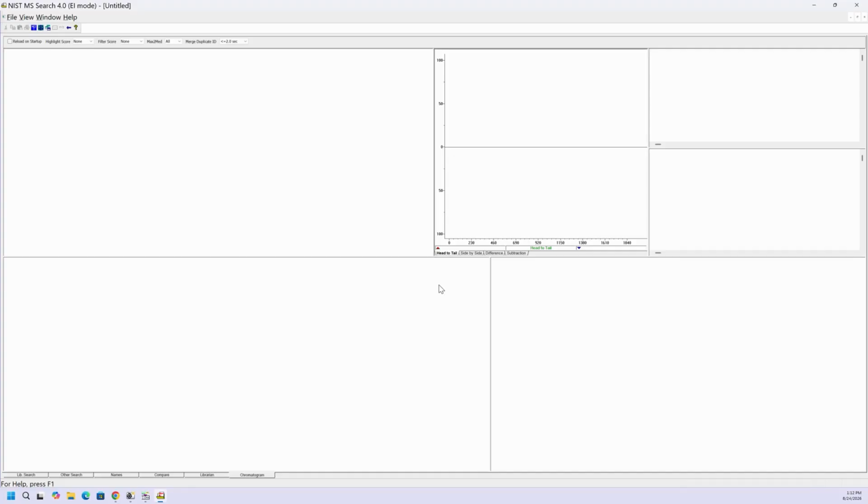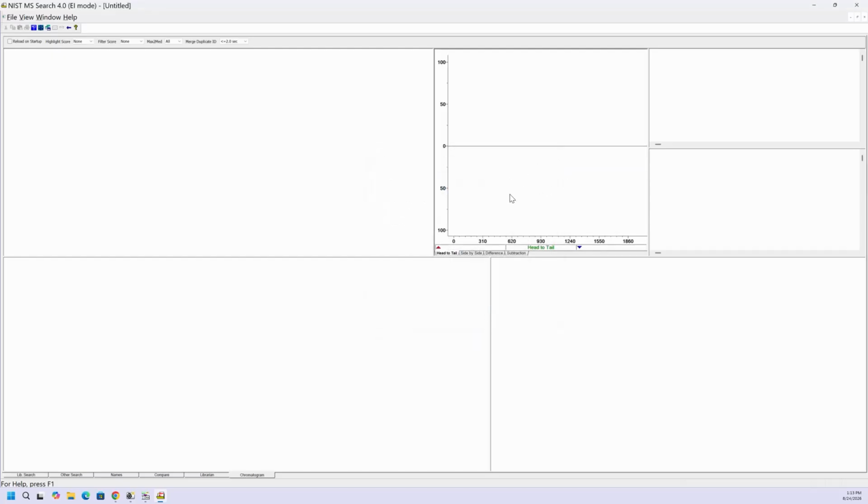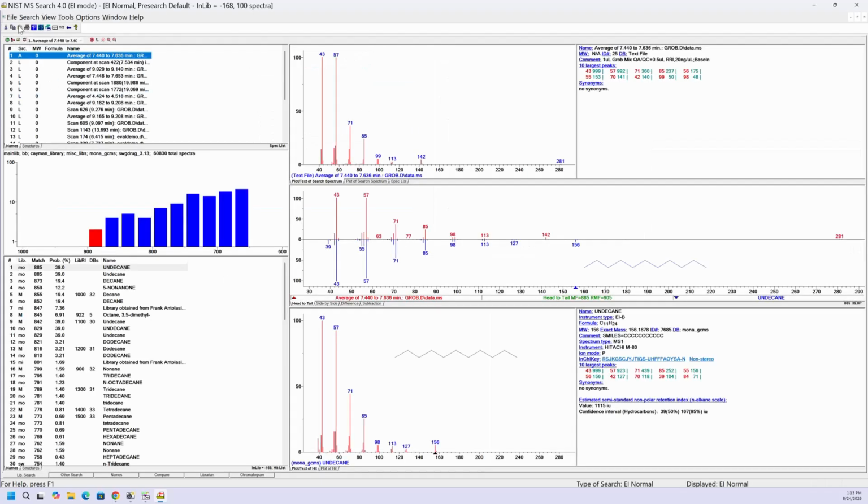So and that being said, we've got all of the settings. The only other one here, if when you get the results here, you won't have the spectrum shown or the structure shown at the bottom, unless if you go to properties and you say structure on plot. And I will say okay, because I want that to display this when we get the results. Well, pretty much all the settings are set where we need to do our searches. So let's go up and save our configuration.